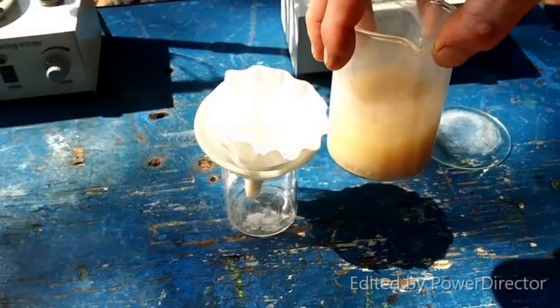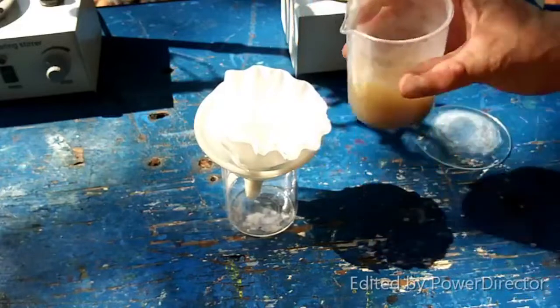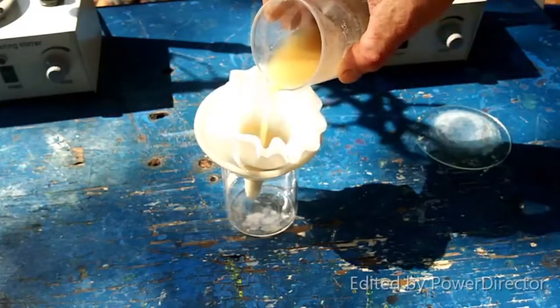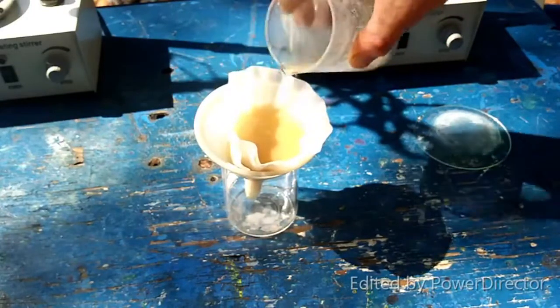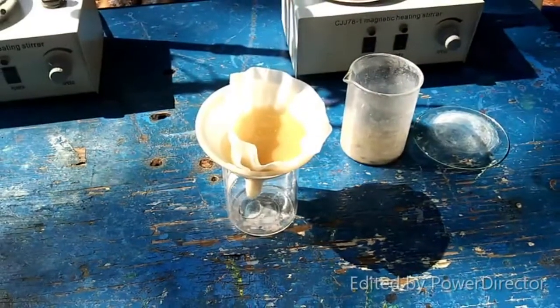The next step is to filter this off, so that's what we're going to do. Got lead monoxide on everything. I've got a cotton plug in there and two coffee filters, and that seems to be doing a real good job with it.